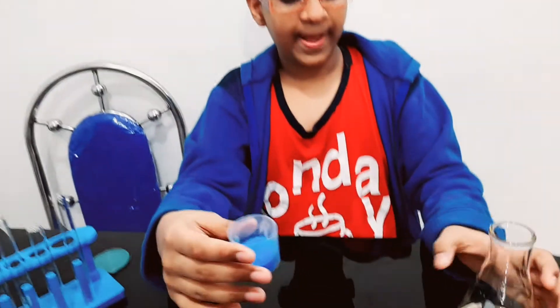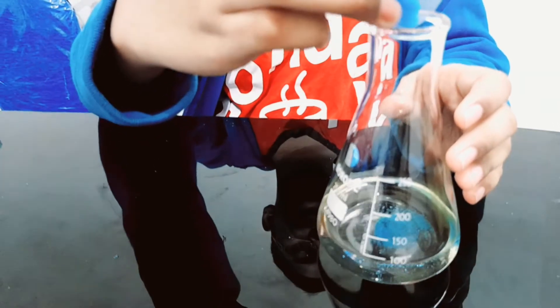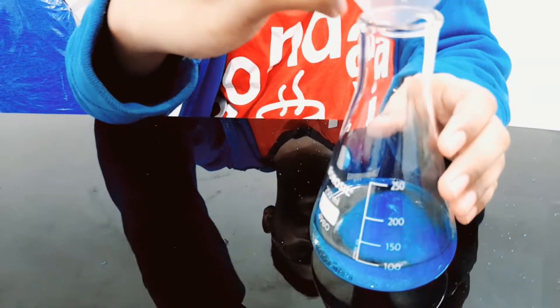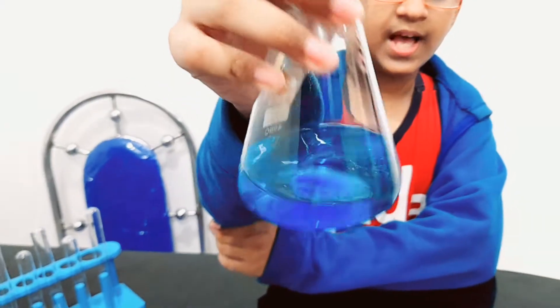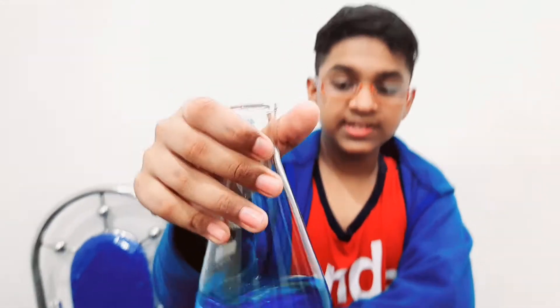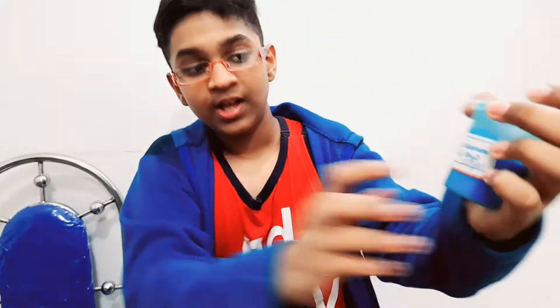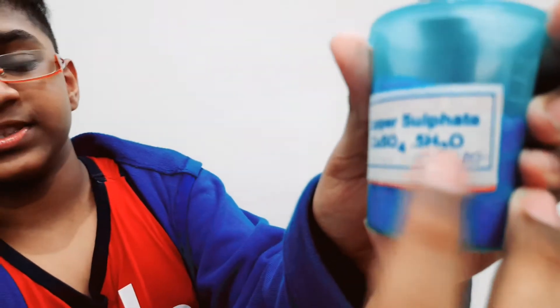I'm adding it to the 100ml of water, safely pouring it in. After this, I've got to keep stirring it using a glass rod or something. This is a mixture of copper and sulfate, and being a crystal it is easily dissolvable in water — as stated on the package, it dissolves readily in water.